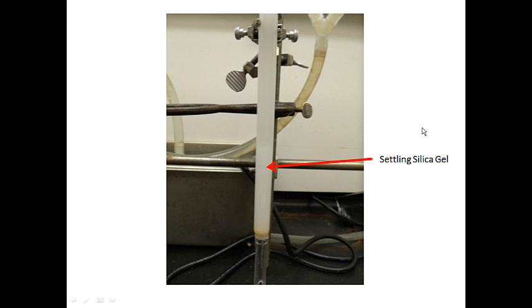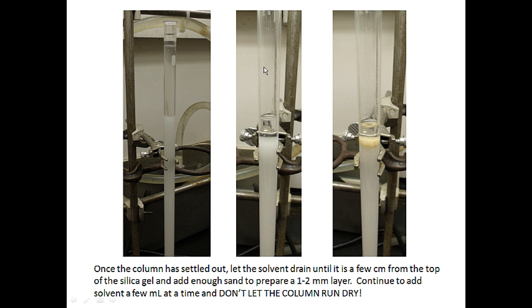Okay. Here you can kind of see a better idea of that settling process. Here is the line that actually is between the settled silica gel and the silica gel that's settling from the solution. Eventually, this line will grow up the column until you get a nice separation of the liquid and the settled out silica gel, which now makes our column. And you can kind of see that better here. Here our column has now settled out, and the mobile phase is up here, and the mobile phase is now going to run down the column.